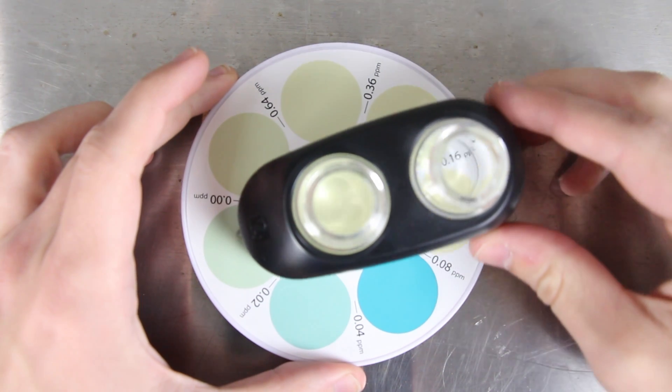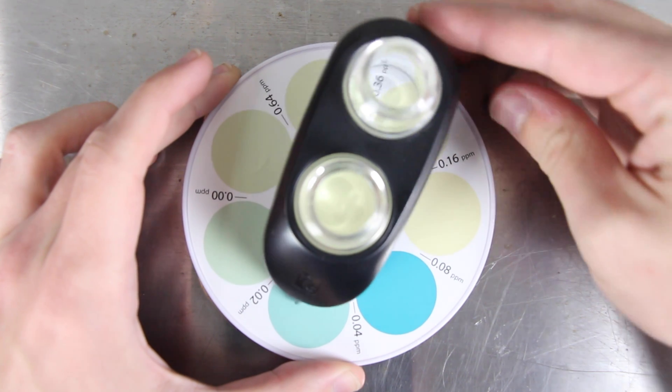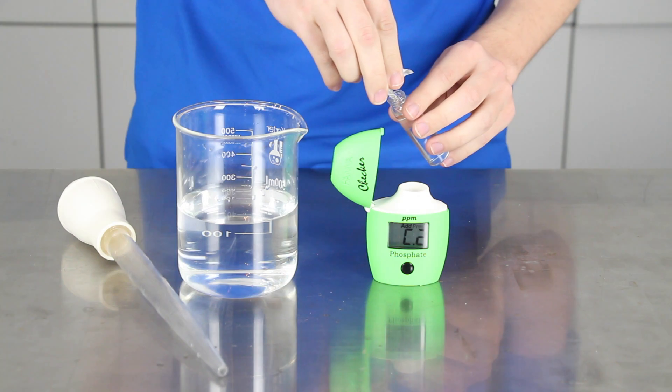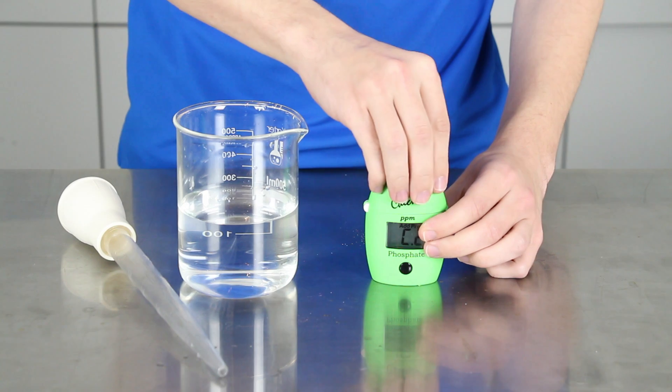A majority of liquid phosphate test kits require the use of a color reference chart, which can make it difficult to get precise, accurate readings. The Hanna Instruments phosphate checkers help to eliminate the risk of human error and make testing your phosphate levels easy, accurate, and mess-free.